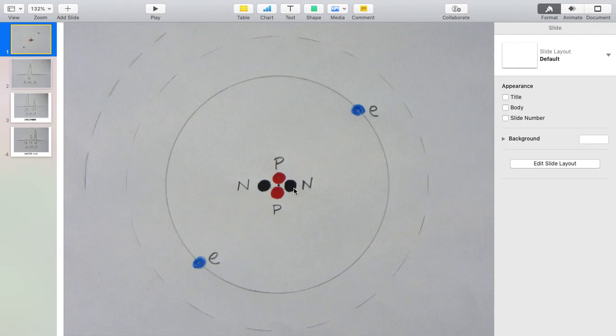First of all, the way a force is applied to an atom or molecule is that one of these electrons is removed. So the atom or molecule is subject to a stream of electrons which approach the thing we're trying to analyze, and because these shells only allow carefully controlled configurations of electrons, when another electron occurs and there's one too many, this causes the thing to become unstable and it gets rather wobbly and electrons fly everywhere. And once an atom or molecule has lost an electron, because it's in a vacuum in a mass spectrometer, it's not possible for it to regain an electron.